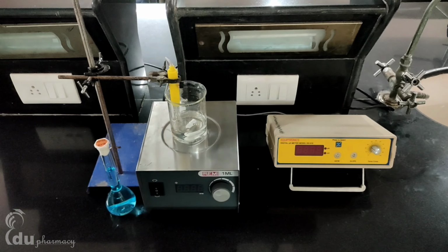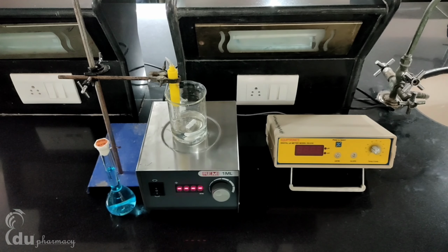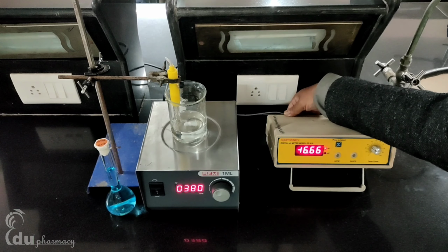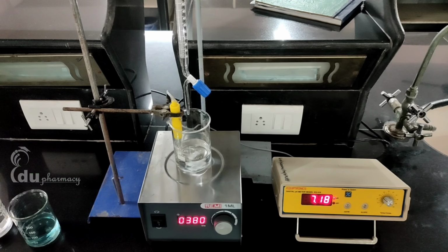Now I will put the magnetic bead into the solution, start the stirrer, and measure its pH. The pH of the glycine solution is continuously increasing. We must note the pH reading once we get a stable reading on the pH meter. In the burette, I have taken 0.25 normal sodium hydroxide solution. We must arrange a burette in such a way that we can add sodium hydroxide to a glycine solution.